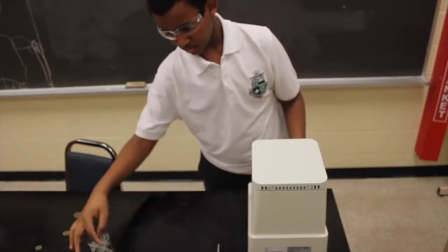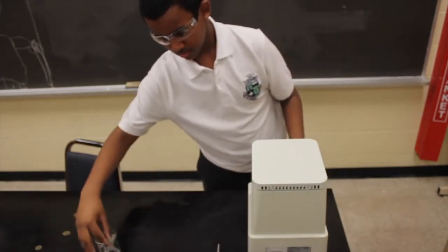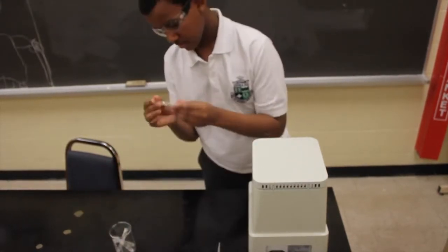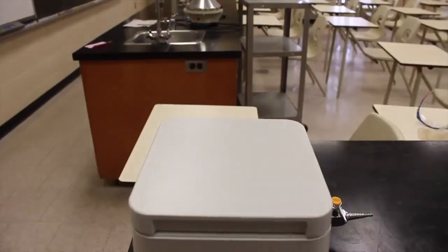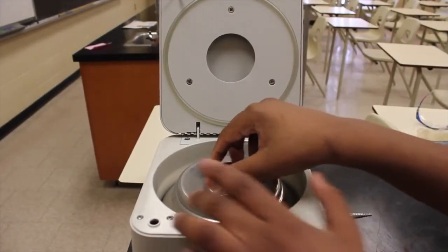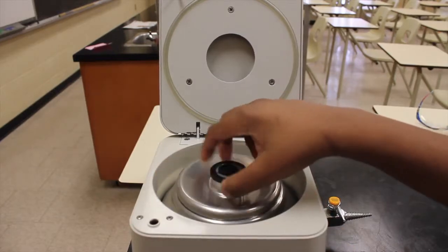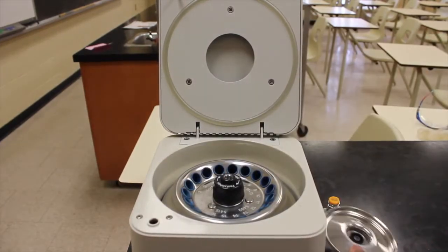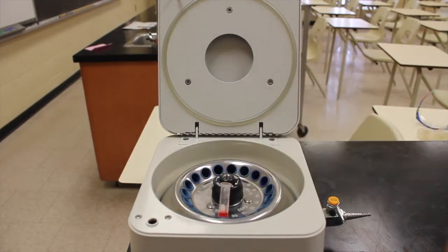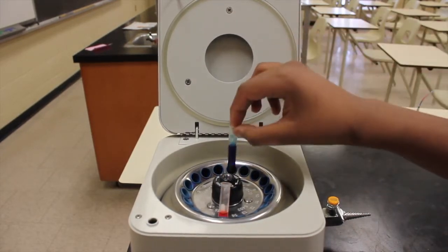Before using a centrifuge, make sure the test tubes do not have cracks in them, which would allow the liquid to seep through. In order to use a centrifuge, a mixture must be put into a test tube with another mixture for the centrifuge to be balanced. If the centrifuge becomes unbalanced, it will start vibrating and may vibrate enough to cause it to fall off the work area.